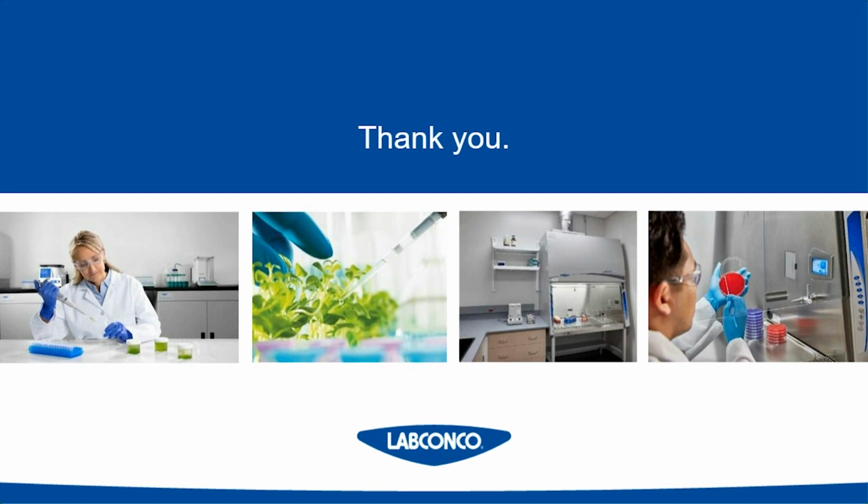If we don't receive any more, our last question here is, what kind of enclosure would you recommend for automation equipment? That's a great question, and one that we get more and more often these days. Traditional biosafety cabinets are designed around a user sitting and working, usually doing their cell culture or something like that. Now, when it comes to automated equipment, this could be a liquid handler or something that's pipetting liquids into plates for you or things like that. You're really defined by the size of the cabinet as far as what equipment you can place in it.